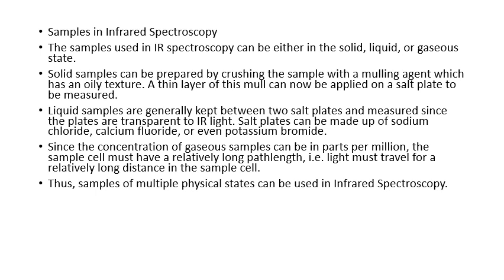Here I want to mention that sample preparation is very critical, very tricky. Results are based on sample preparation, how good you are at preparing samples. You have to crush well, mix well, and apply on the salt plate very well. Then you will get good results.